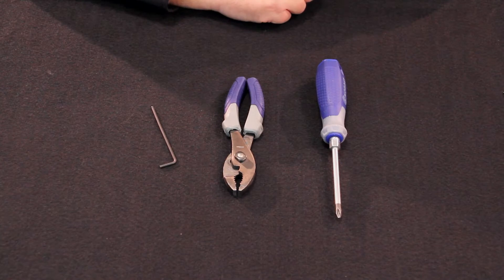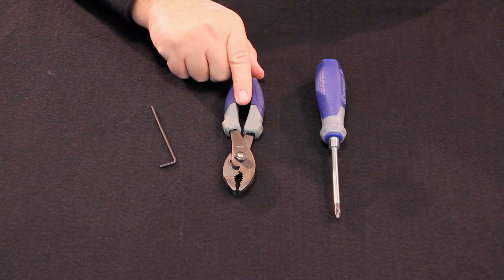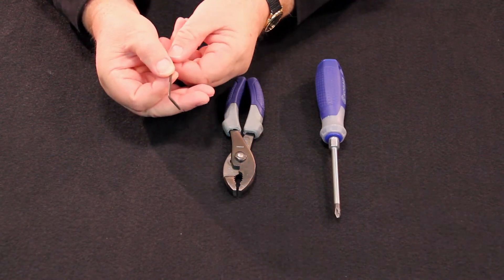To reinstall the flow adjust knob, you'll need a number two Phillips head screwdriver, a pair of pliers, and a 3/32 inch hex key.